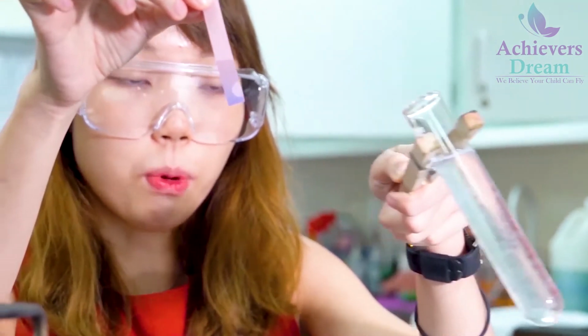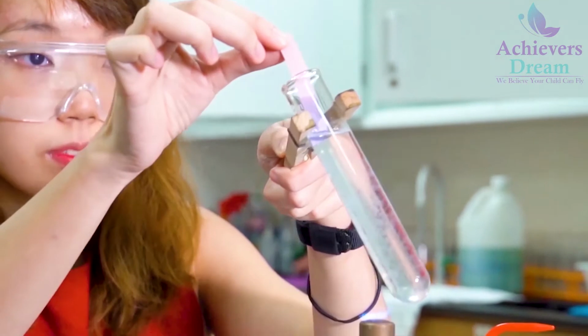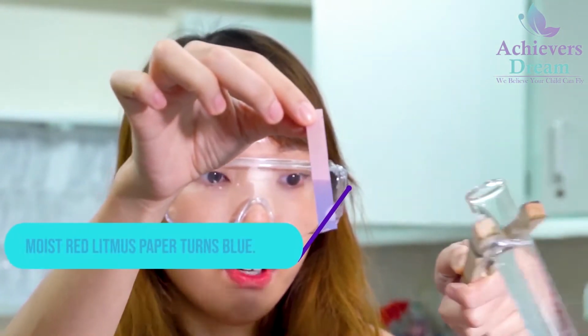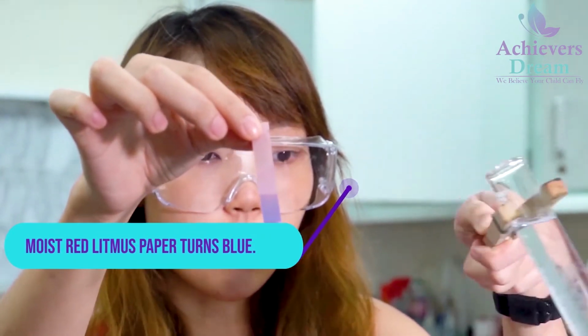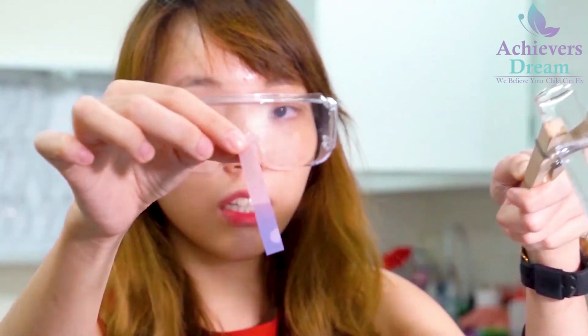Okay, and you can see that your moist red litmus paper has turned blue. Okay, so this is the final color of your moist red litmus paper. So this indicates the presence of an alkaline gas, which is ammonia gas.